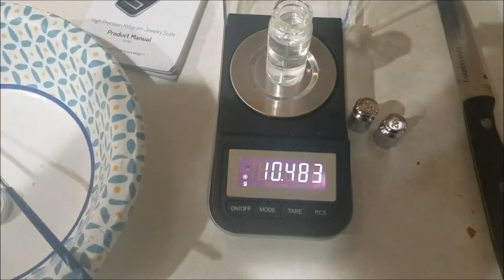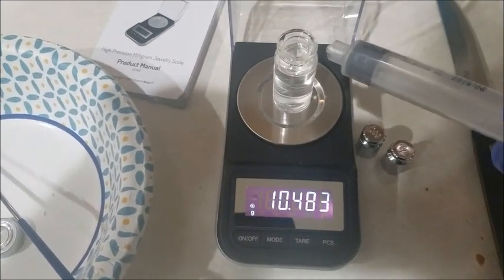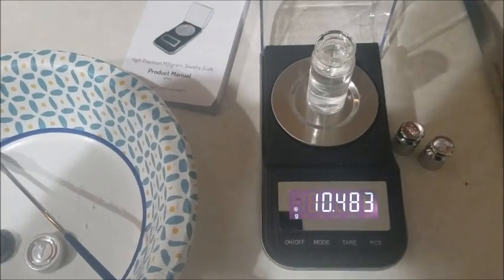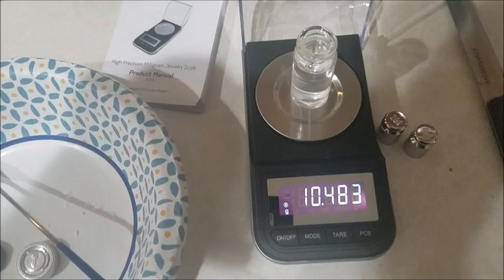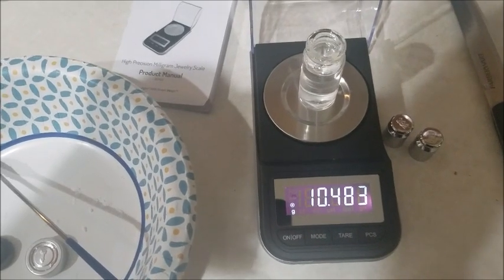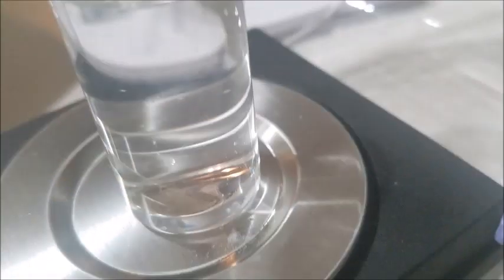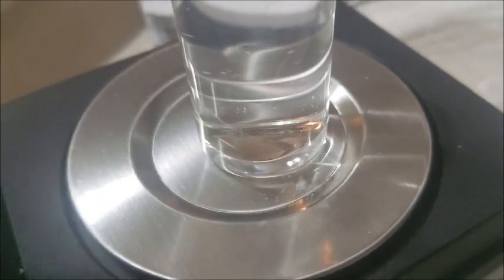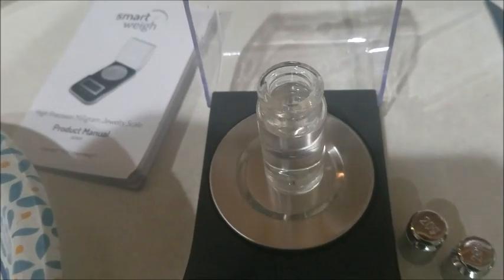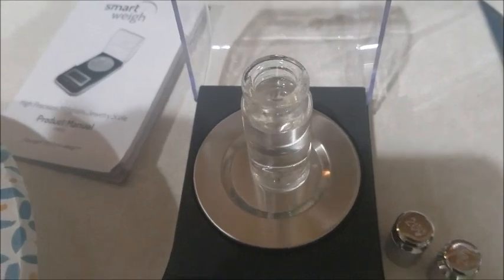Now to make this lidocaine powder soluble with the water, we're going to need to heat it up to 182 degrees, which is lidocaine's melting point. So we're going to put it back in the pot, and we're going to use it as a double boiler. I don't know if you can see, but the lidocaine powder is still there in the bottom. It's not dissolved into the sterile water yet. So we're going to use the same pot that we boiled the water in to sterilize everything, as a double boiler to cause the lidocaine to go into the water solution.